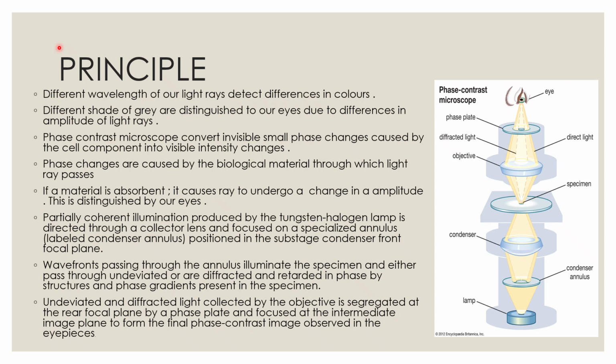In a simpler way, the light passing through the specimen will come out late. The light will slowly pass and it will take time to come out.